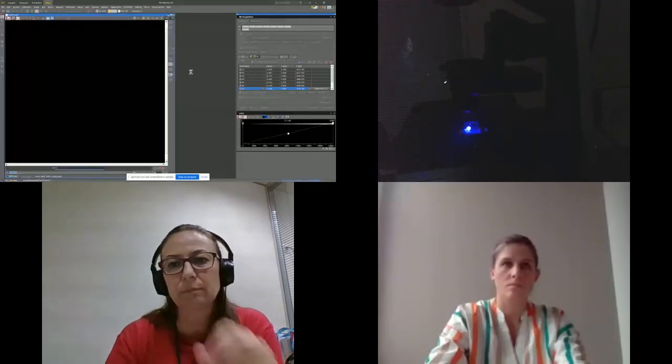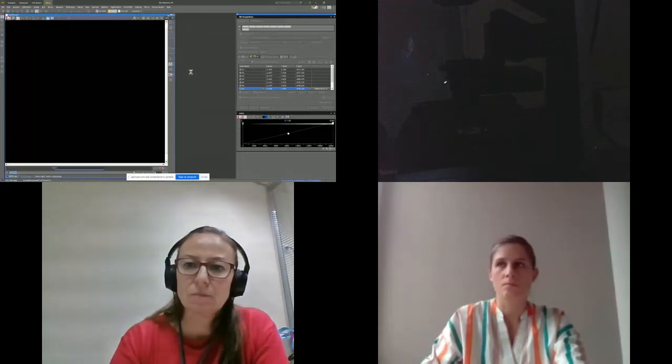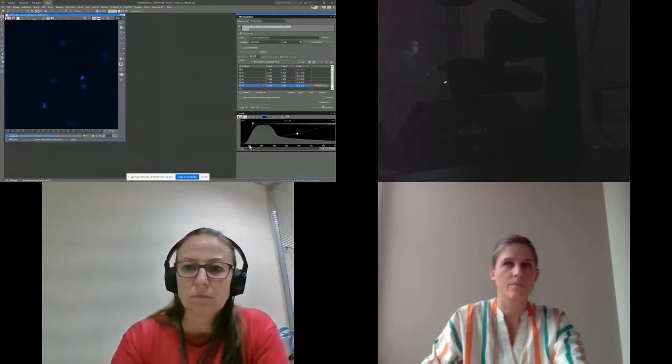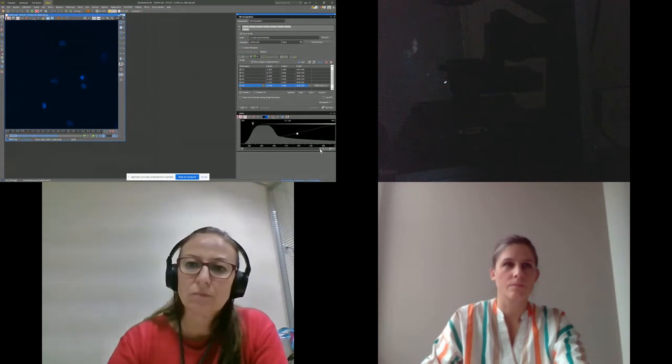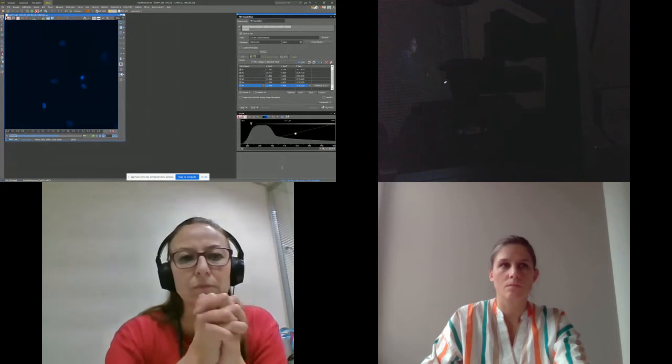So the system is going to take the 7 images. So here they are. As you can see here, let's look at the dynamic range of these images. The dynamic range is really small. I'm going to move approximately from 380 to 460, so less than 100 bit levels. So it's really a bad signal to noise ratio, something like this.